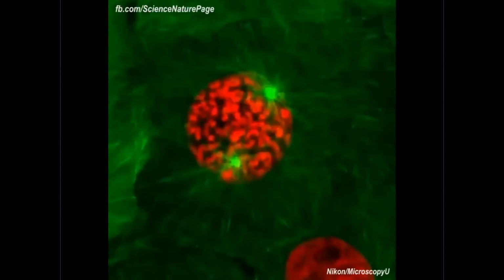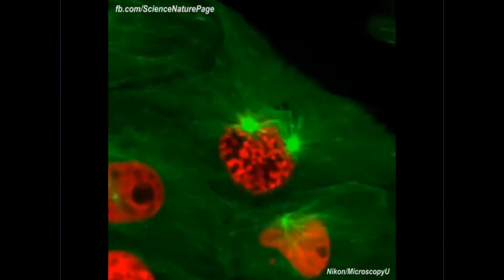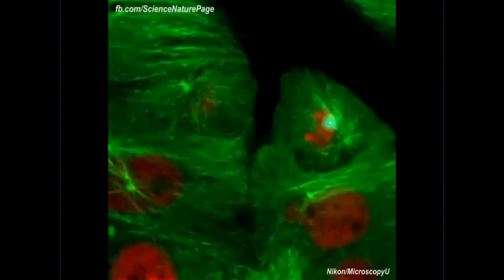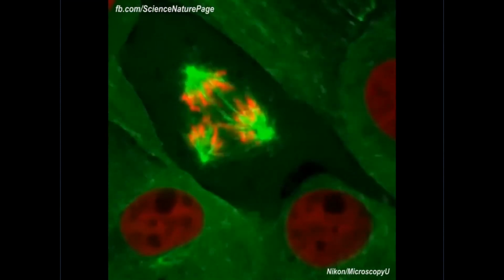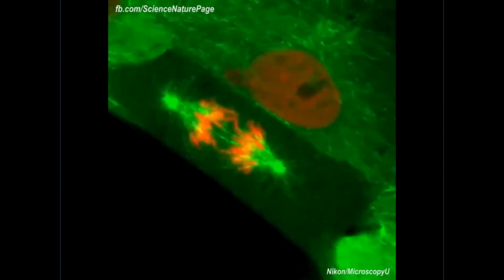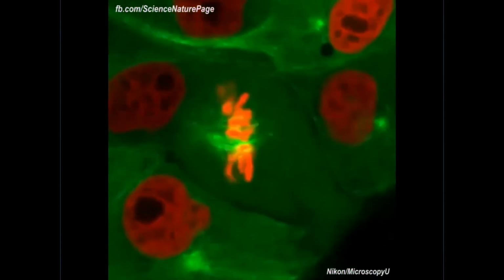And these are cool pictures, but the cool thing, of course, is that this can be done in real time. So this is a movie where you're looking at mitosis, so cells dividing, and you see this mitotic spindle. So you have the centrosomes that are pulling the chromosomes apart. So everything here has been stained. So it's really nice that you can look in real time at what is going on in these cellular processes. And that's a very unique factor in using fluorescence microscopy. So it's very heavily used in biology.